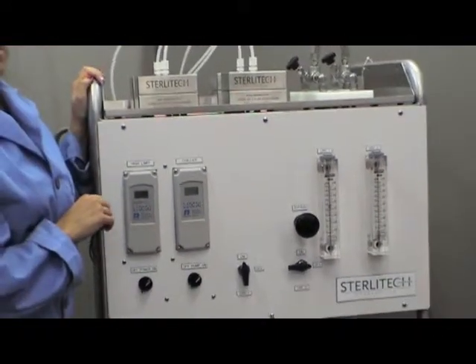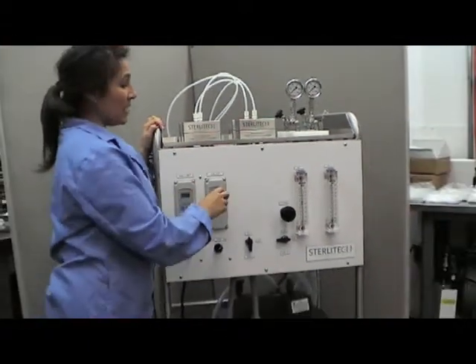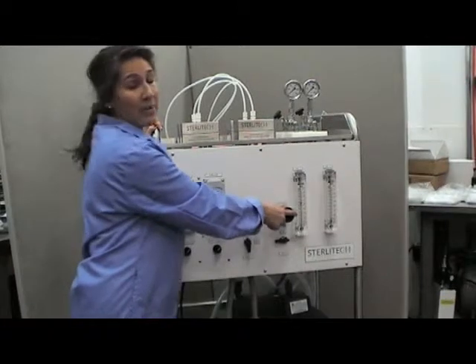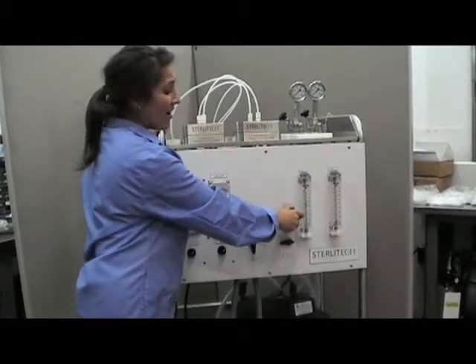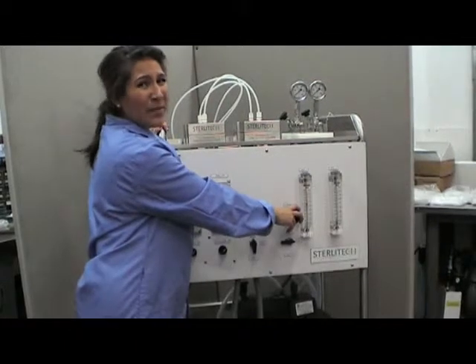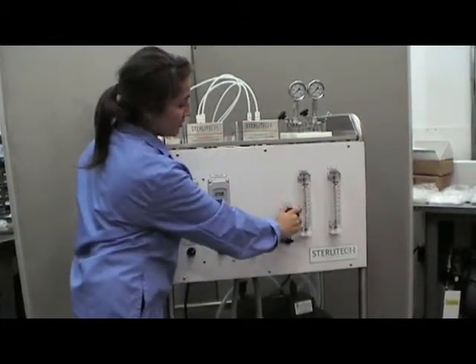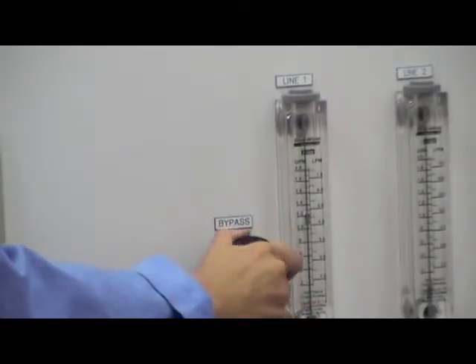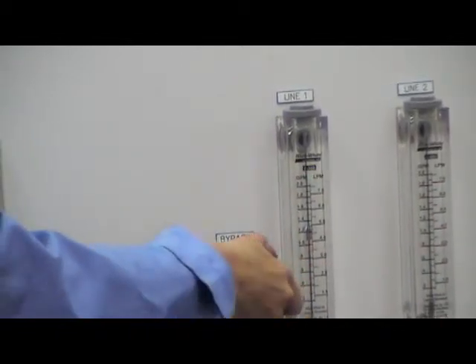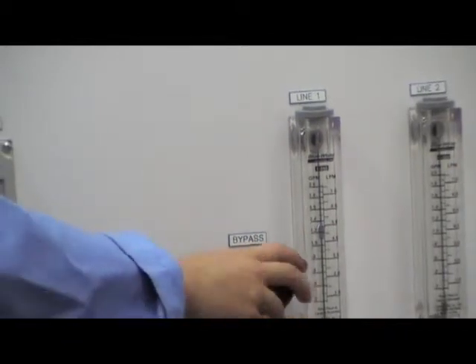To start setting the system to 300 psi you'll need to slowly begin closing the bypass valve by turning the knob to the right. We currently have the system fully open so it may take a couple turns before you achieve this and see the flow begin to increase. It won't happen immediately so be patient.